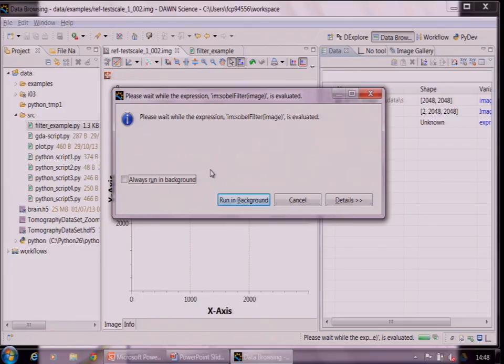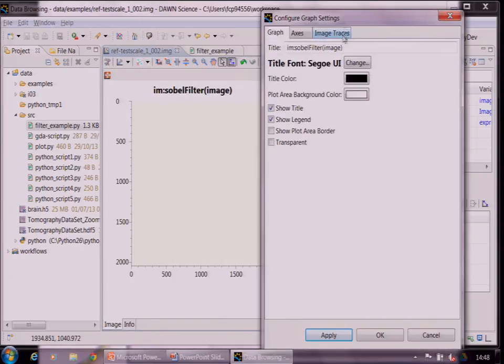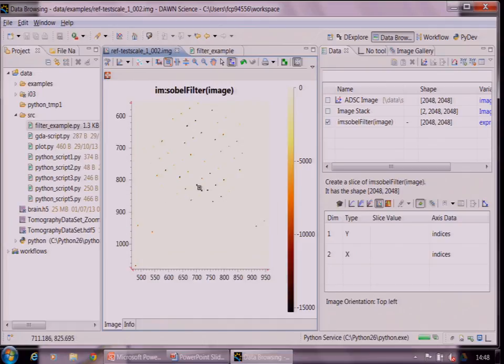I believe it's an edge detection algorithm, so it highlights the deltas between features in the image. You can't see very much, that's not surprising. We can see it's detected some features, which, using the algorithm, has brought out the spots.